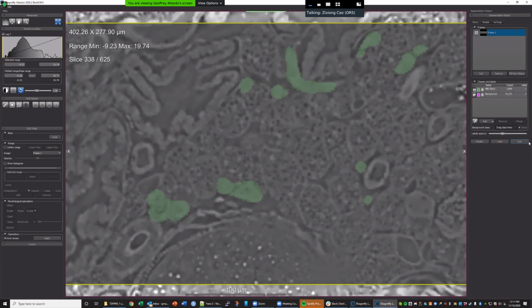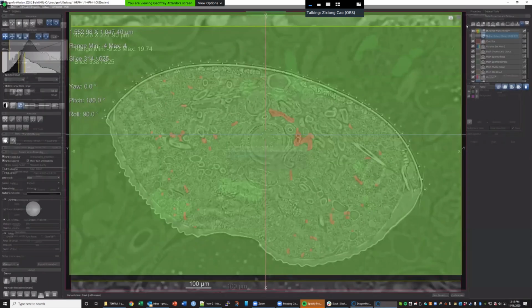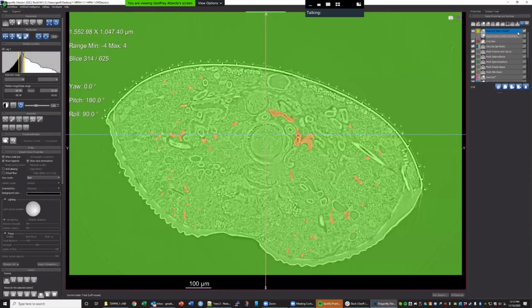Yes, we could exit this. Every time we exit the wizard, it will save everything we have done, like the model trained or the frames we created. It saves everything in this object. So if you want to save your work with the wizard, you just save this object.